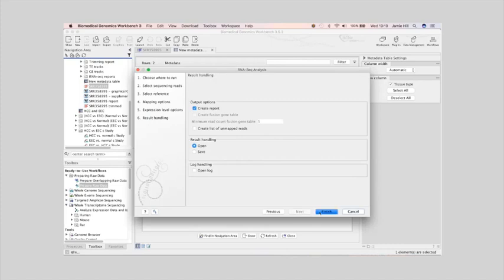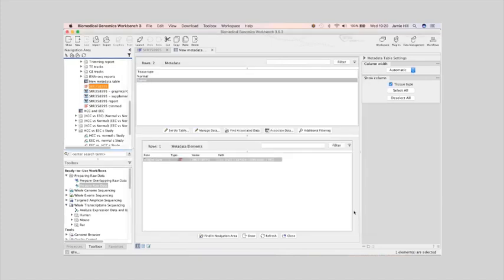And that's it. Now I can press finish, and I'll get a report out, and I'll get out all of these other things that I've been describing before. I'll get out a gene expression track and a transcript expression track, listing the expression levels in each of those two. I won't do that now because my computer will hiss away for half an hour or so, and it'll get distracting during the rest of the presentation.